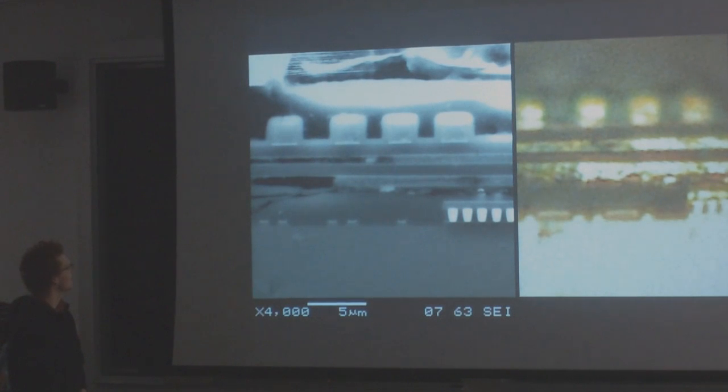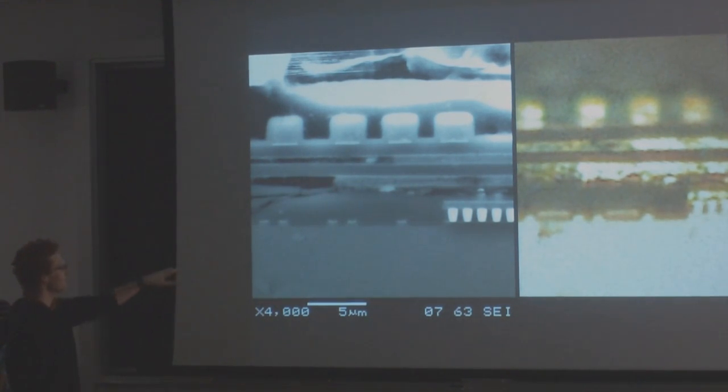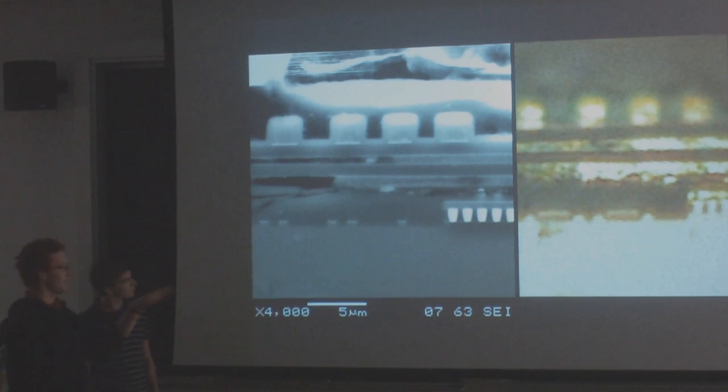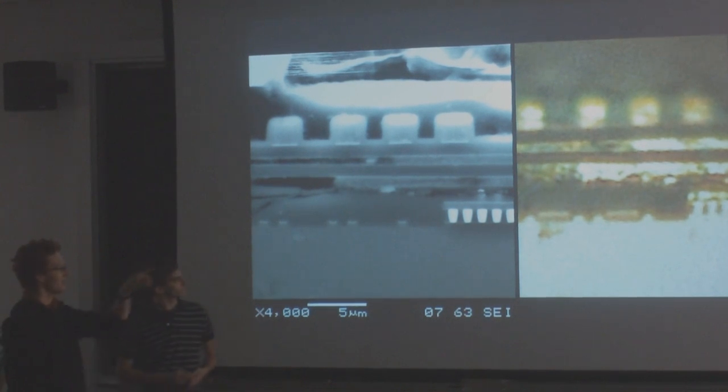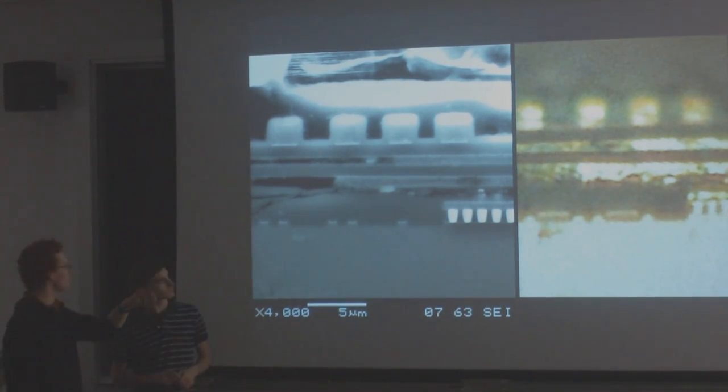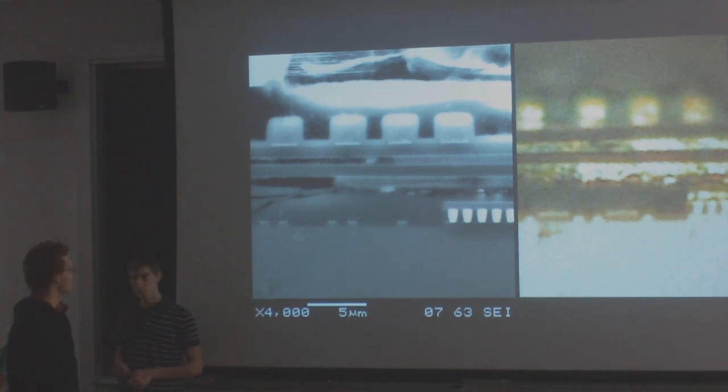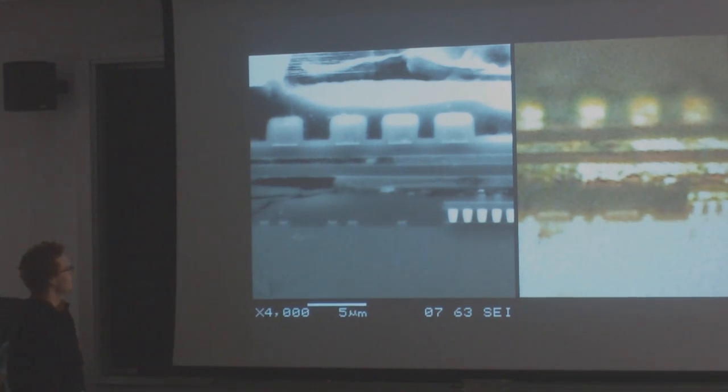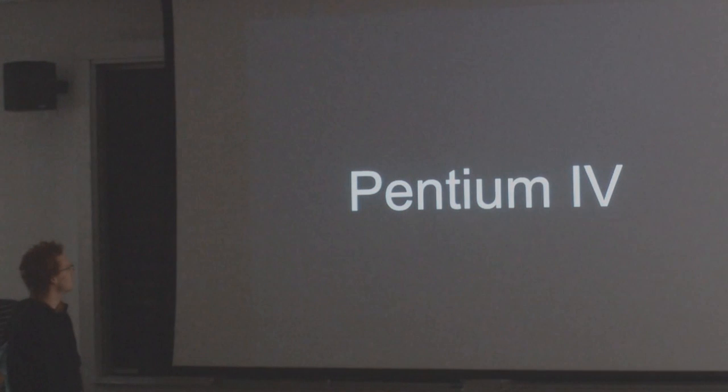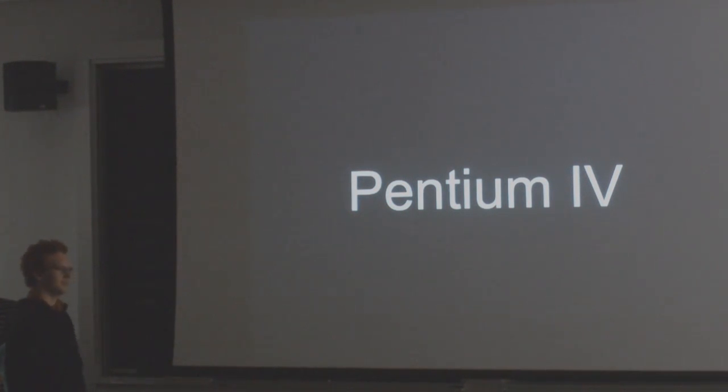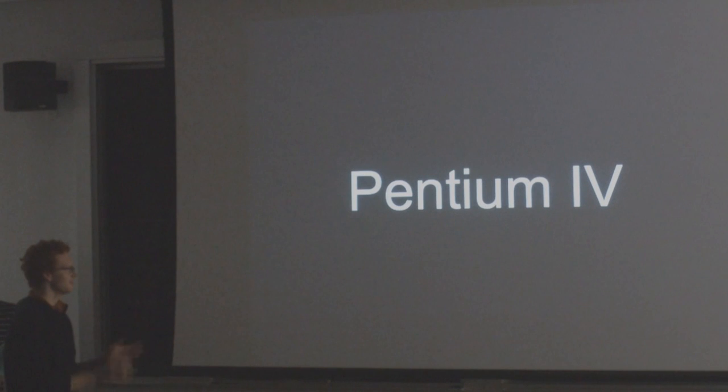A little bit closer, same view. You can see we were very surprised that we could get this close with an optical microscope, but you can tell that the SEM does do better at this magnification.